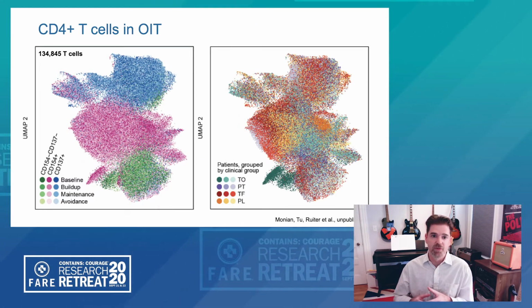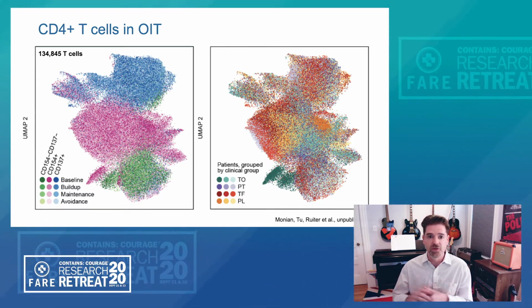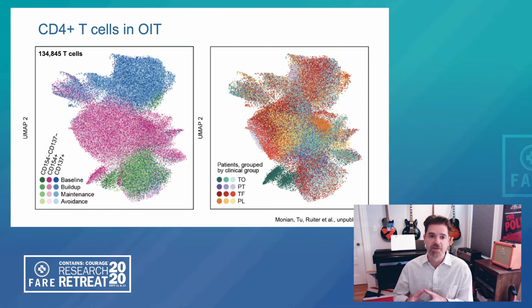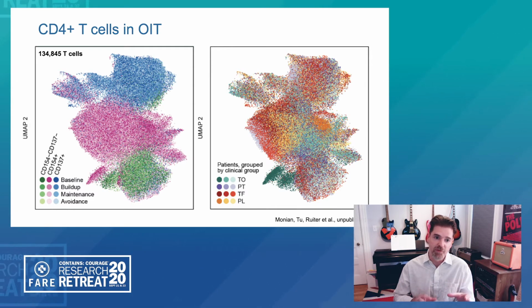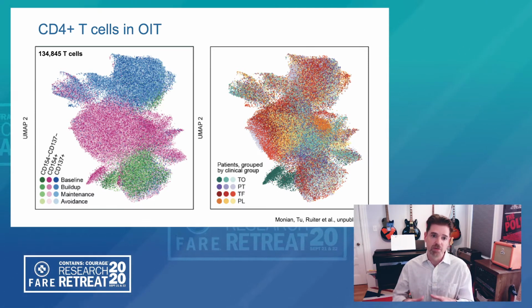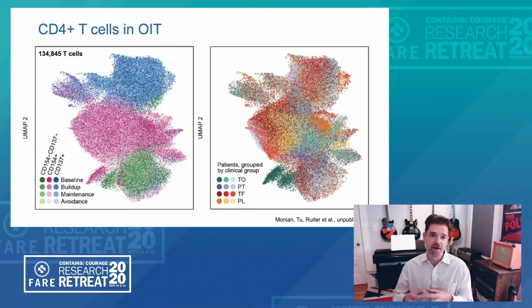In these data sets, in total for 12 patients, we have about 135,000 single T cell events that we have scored. You can see on the left-hand side of this slide the segregations of these based on surface expressed protein markers, canonical CD154 and CD137 as activation markers, as well as a double negative population. So the CD154 positive set is a group that we would associate with an antigen-dependent response in that CD4 population. You can see they segregate into a nice pink cloud.